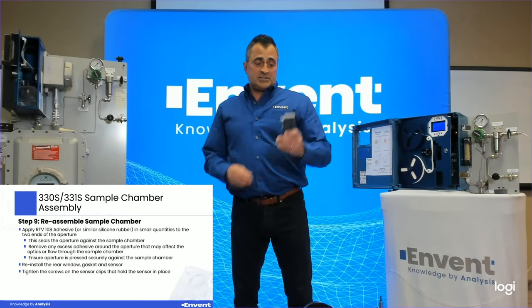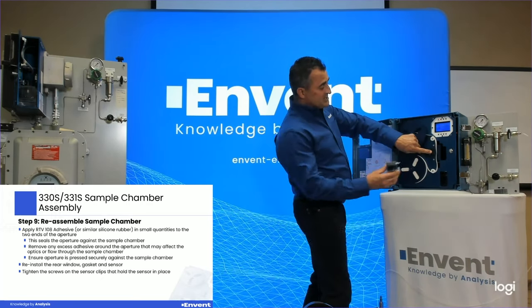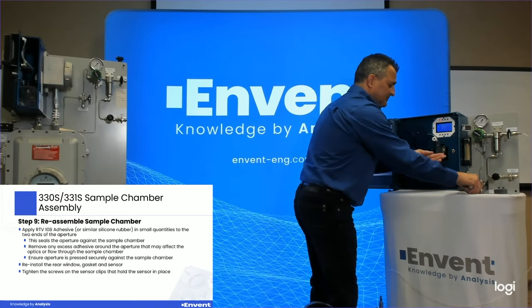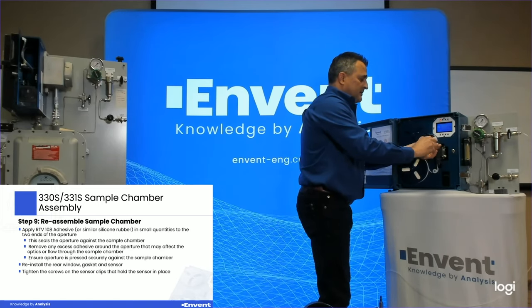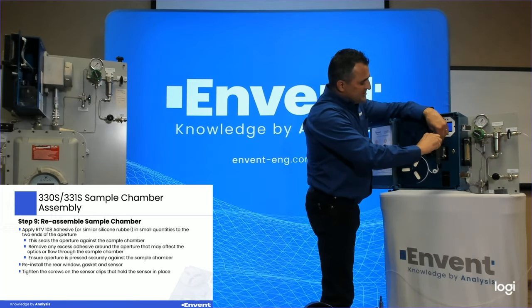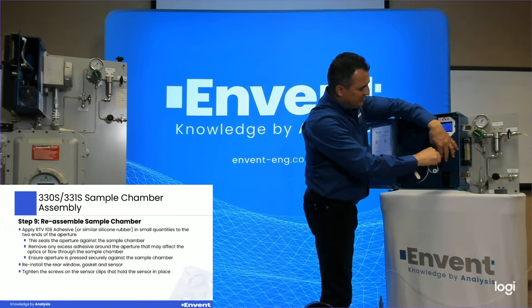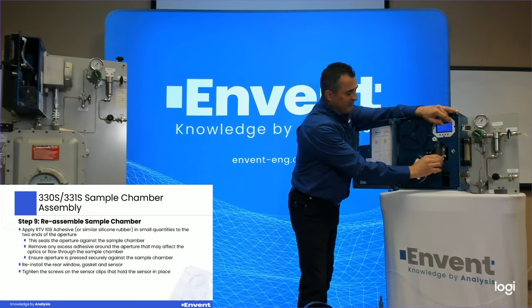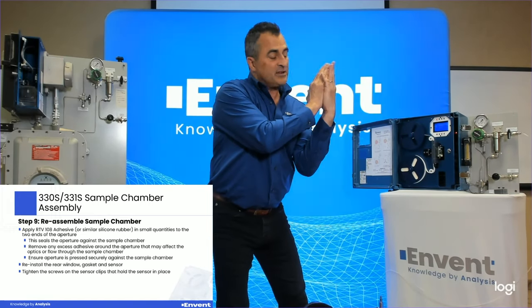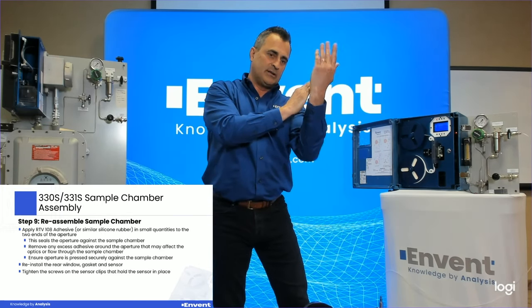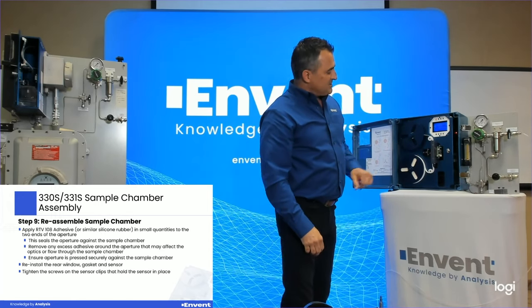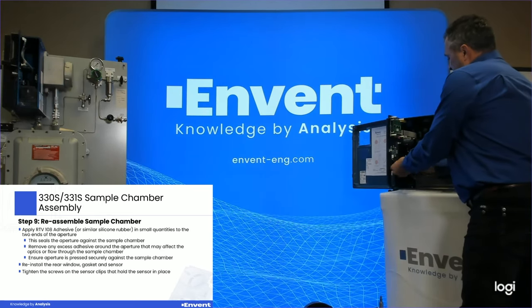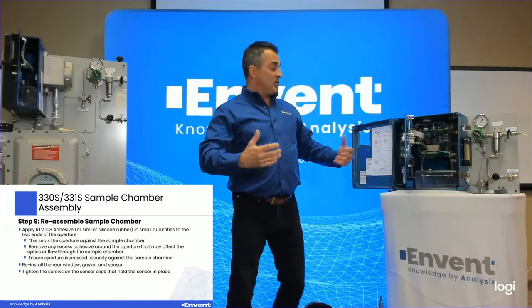Now we've cleaned our sample chamber, so we simply install it — just do the reverse. Hold the compression head back, place the sample chamber in place, the compression head holds it, put the screws back in. Don't use too large a screwdriver — you don't need to torque this down, just snug so it holds in place. The critical part is making sure the tape is sitting in that groove — you don't want it folded. If you push the compression head against tape that isn't fitting perfectly inside that groove, as it advances it can walk its way out. Our tape is in place, sample chamber is reinstalled. Plug in the connector and connect your vent side and supply side.